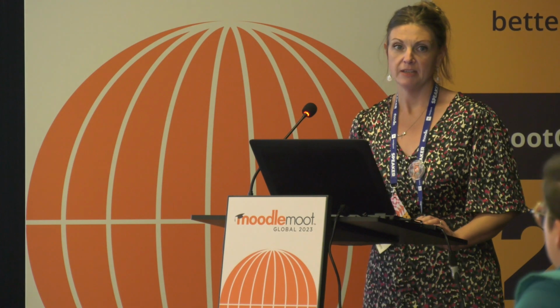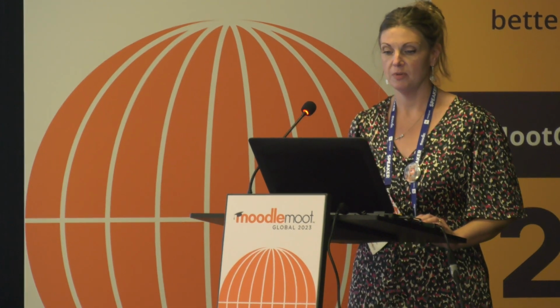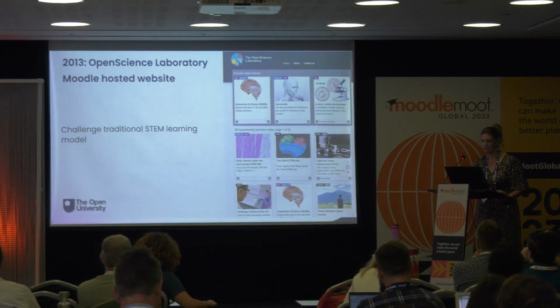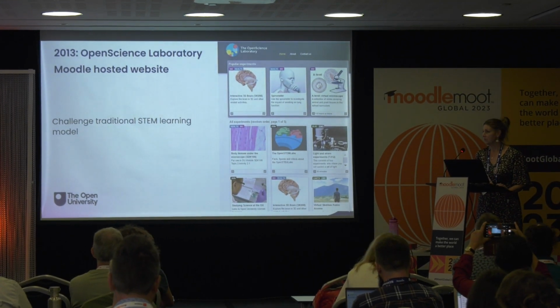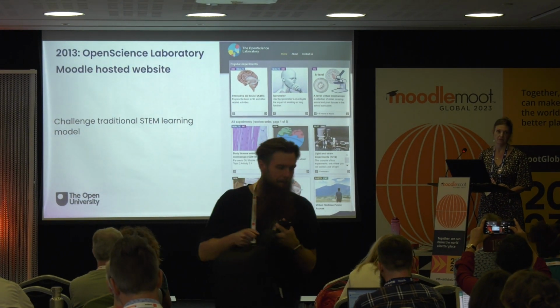So, what is it? Well, it was originally developed in 2013 and it was coined the Open Science Laboratory. It is a Moodle-hosted website and the aim really was to challenge the traditional university STEM model of teaching, which is where students and teachers need to be co-located in a lab during office hours.